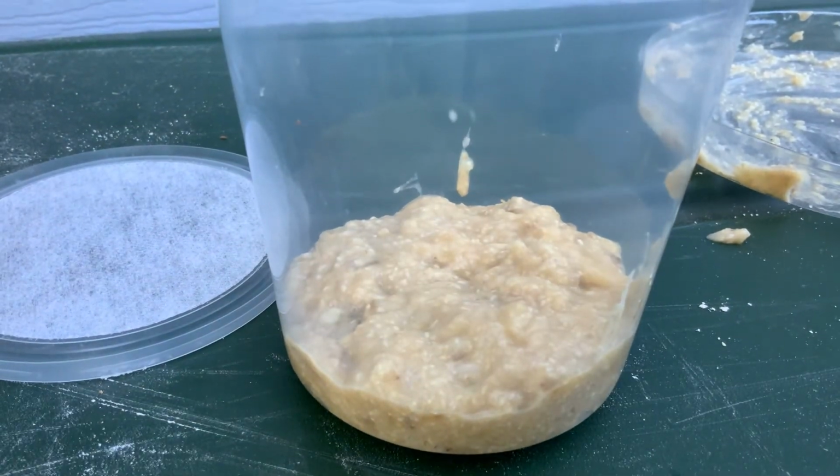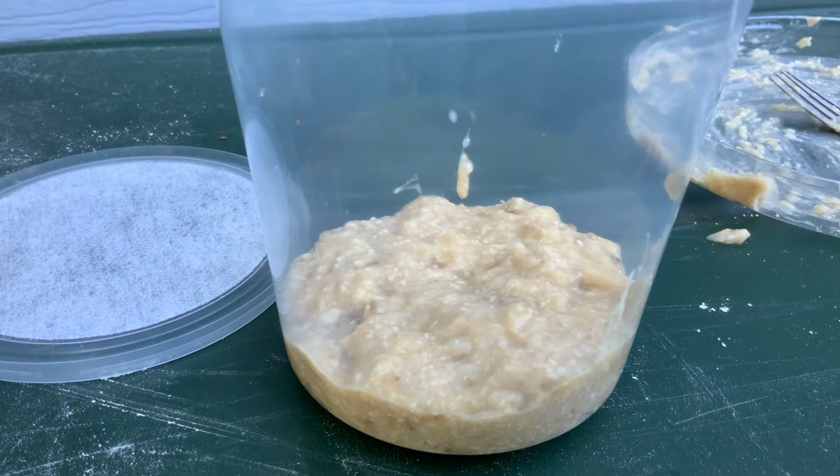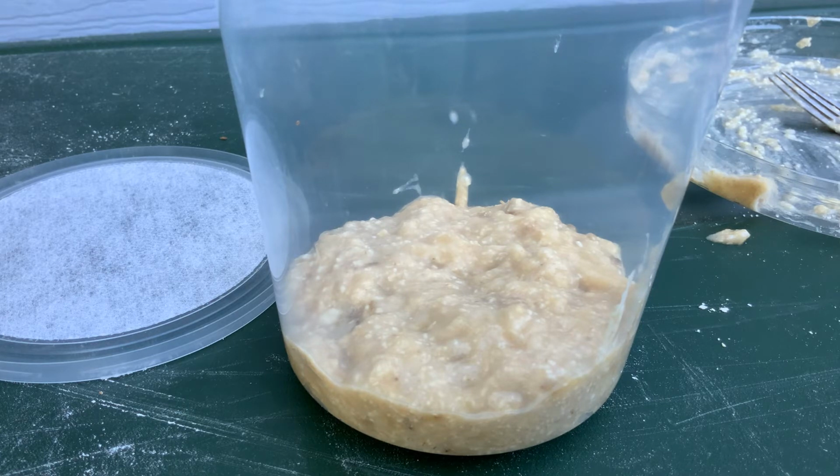All right. Now you can use sticks. You can use straw. You can use really whatever you want. But you need something for it to hang on to, for it to pupate. And so I'm actually not going to use anything from nature because there could be mites. And I'm going to quickly go and get what I'm going to use. I'll be right back.